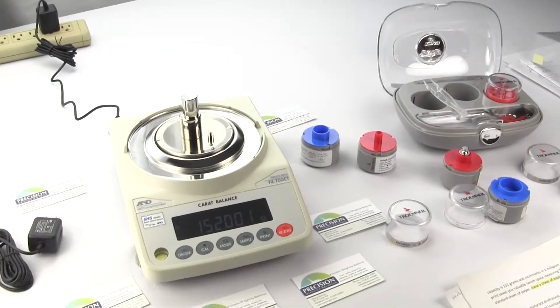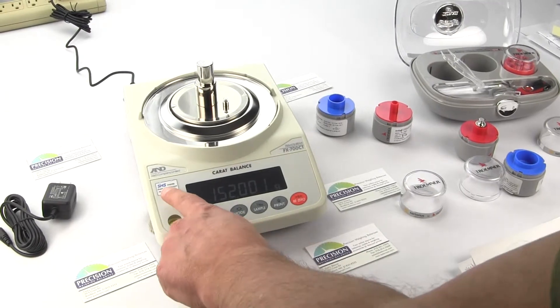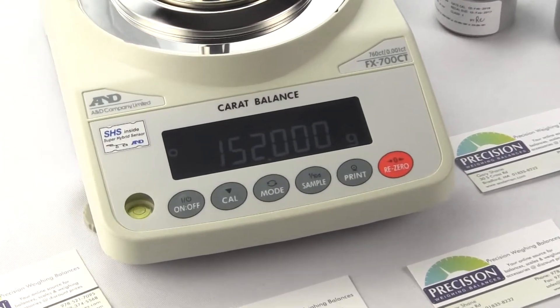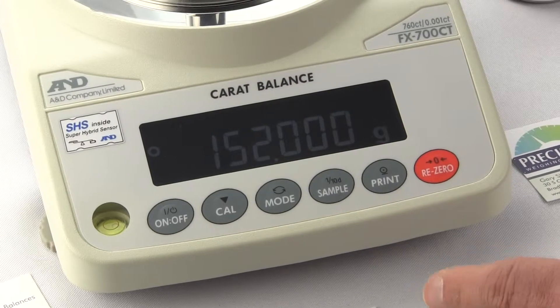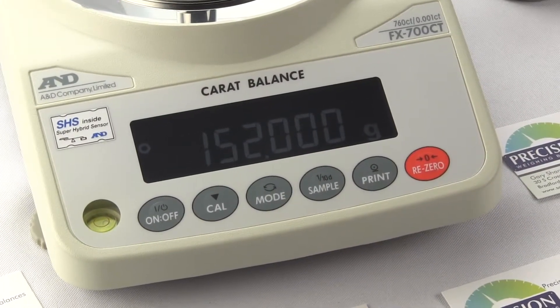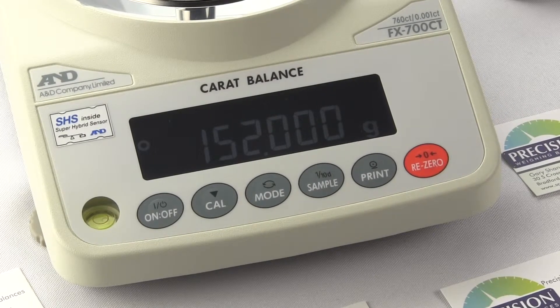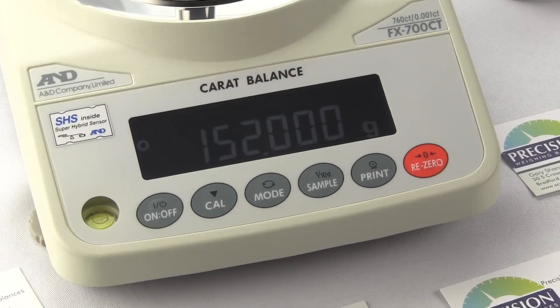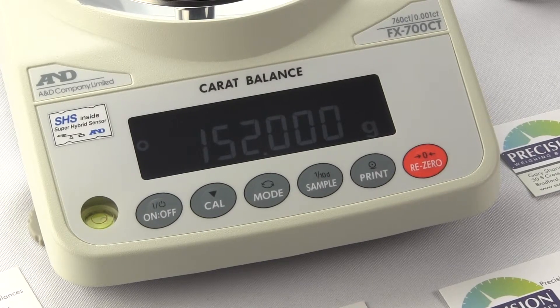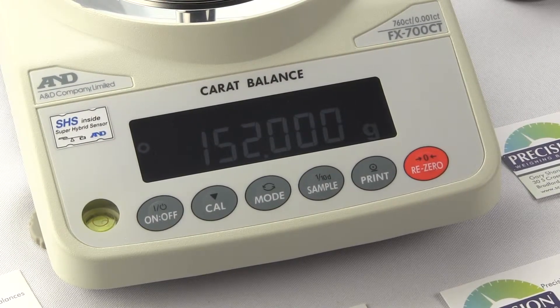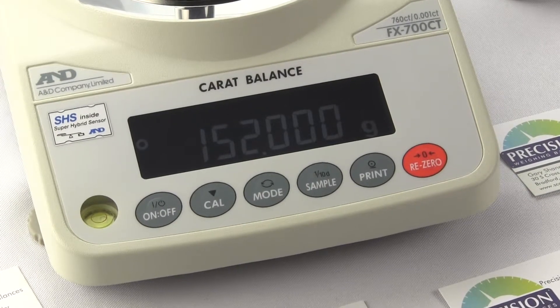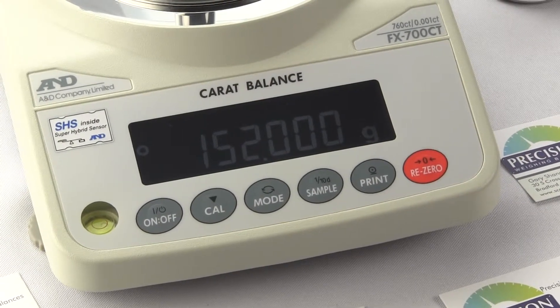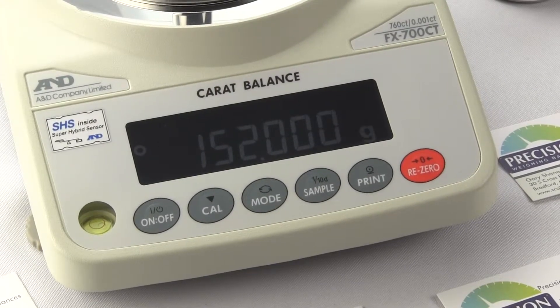The weigh sensor on this balance is A&D's exclusive super hybrid sensor. This is not a low cost strain gauge load cell that are notorious for the numbers crawling so you can see during this video how stable the balance is all together the numbers if you had a strain gauge and we had 152 grams on the balance the numbers would be crawling over a period of time. For weighing applications where the mass is either increasing or decreasing over a period of time you should refrain from a load cell scale. Such applications as calibrating an infusion pump for flow rates where liquid is either being removed or added to a plastic beaker will find the super hybrid sensor delivers consistent accurate results.